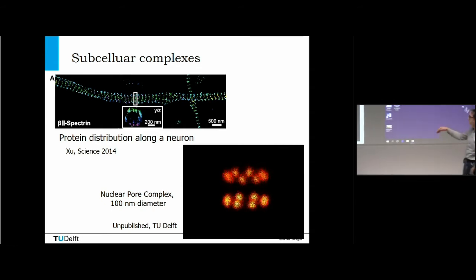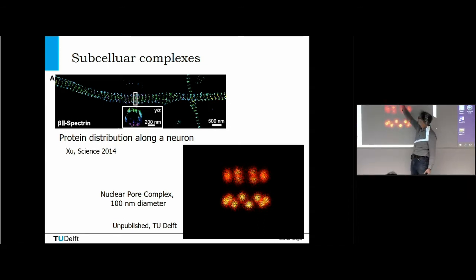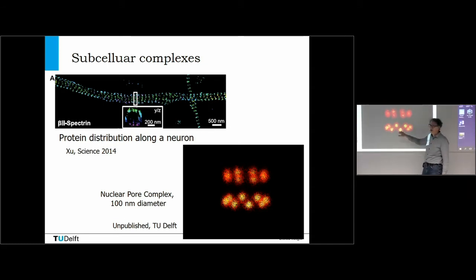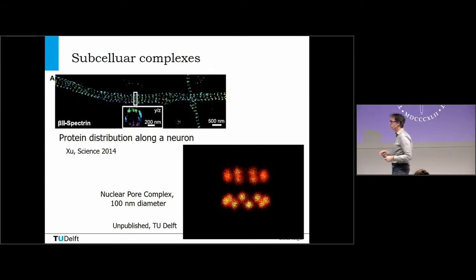So this is this pore that you see, and then all the things that would go through that channel like this. Now the diameter of this pore is only on the order of 100 nanometer, so that's a lot smaller than what you could typically image with a light microscope. But it's people pushing the envelope. Now that's typically these three examples that I've shown you here. That would be typical data that people in microscopy acquire.